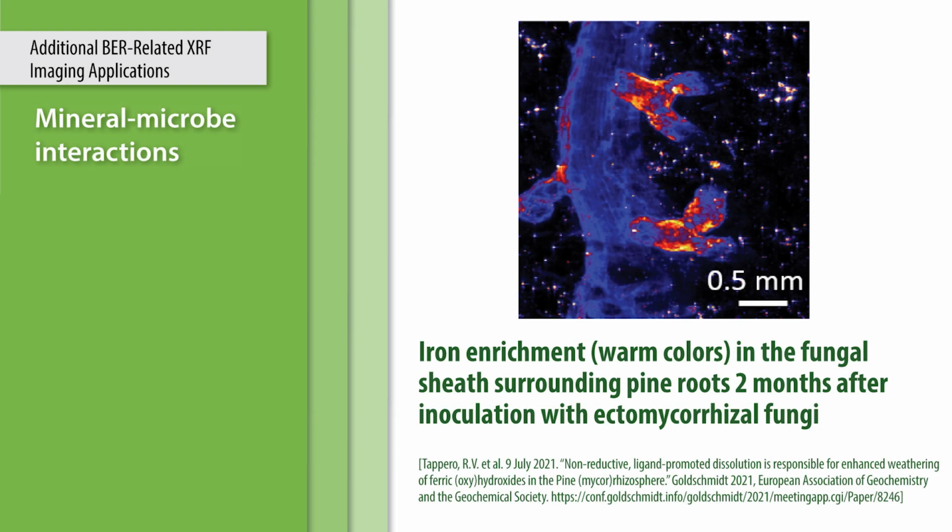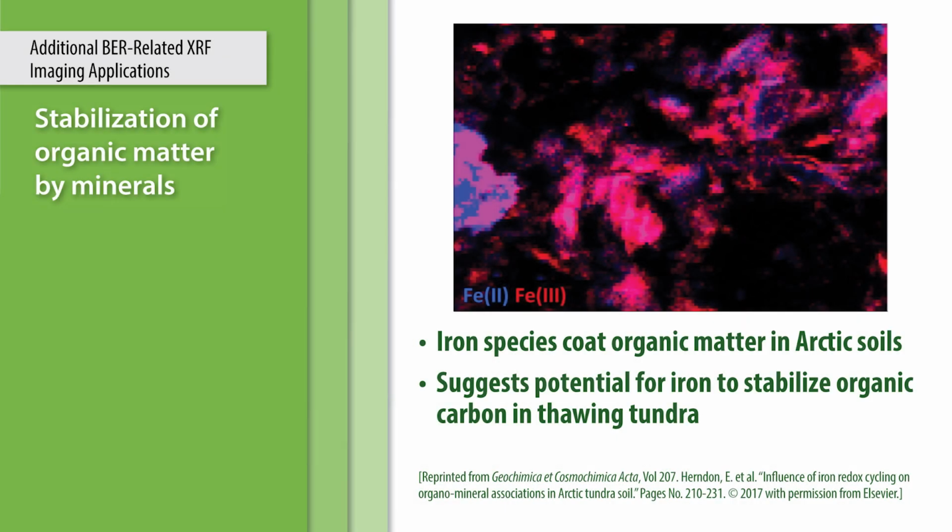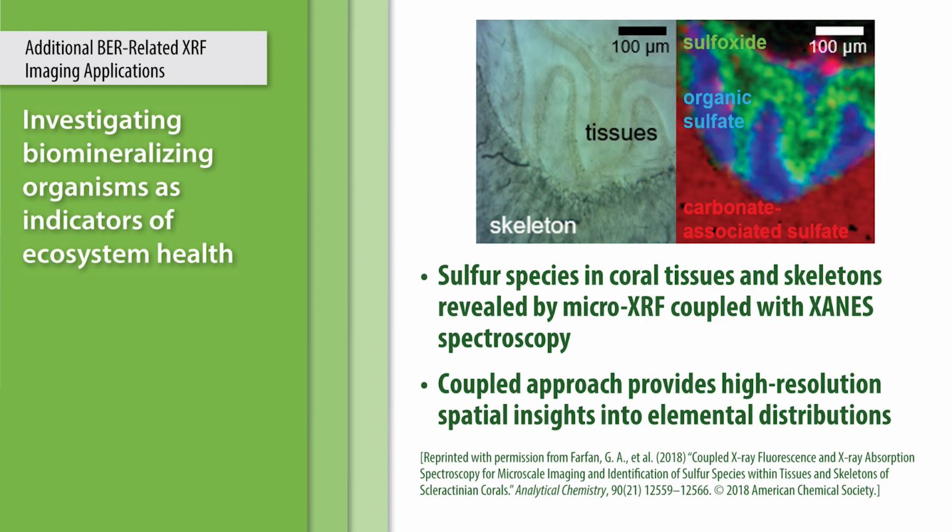Some other BER-related applications of XRF imaging include mineral microbe interactions, determining the speciation and distribution of sulfur and phosphorus in ancient marine environments, the stabilization of organic matter by minerals, and determining ecosystem health by looking at biomineralizing organisms. These are just some of the examples that are applicable to the BER community.